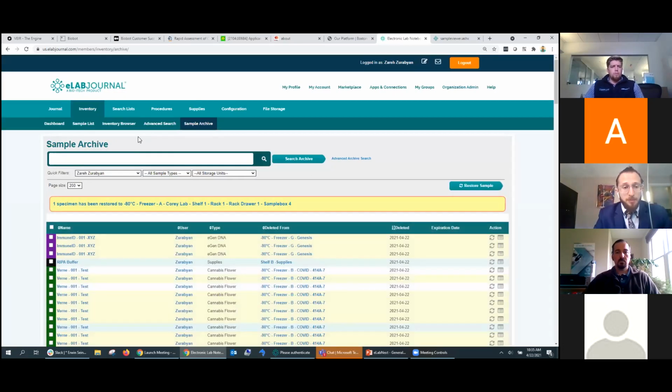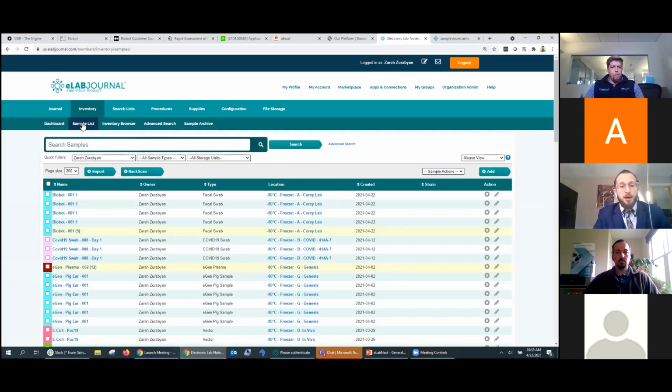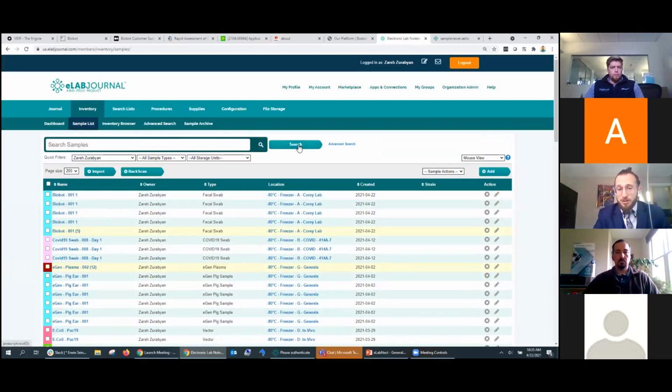So the next logical question is, okay, I've been working with eLab for a year. We've uploaded thousands of samples in here. How do we access it? How do we find it? And what are the search capabilities?